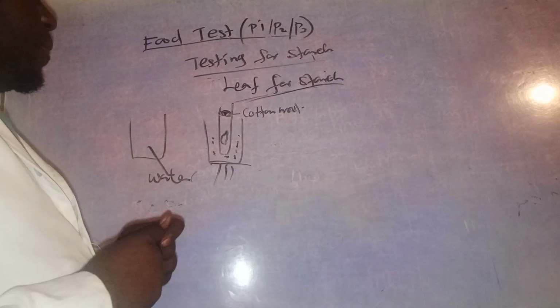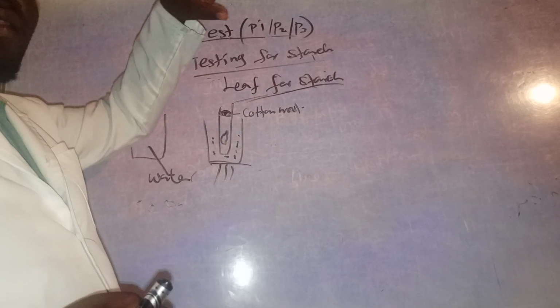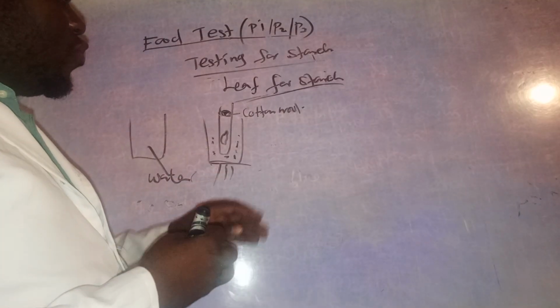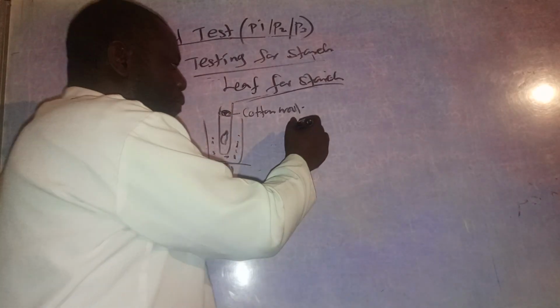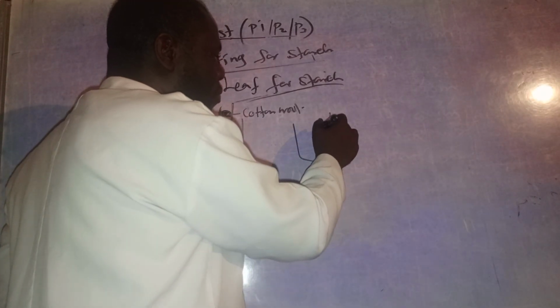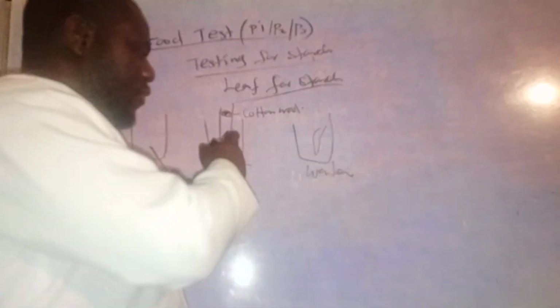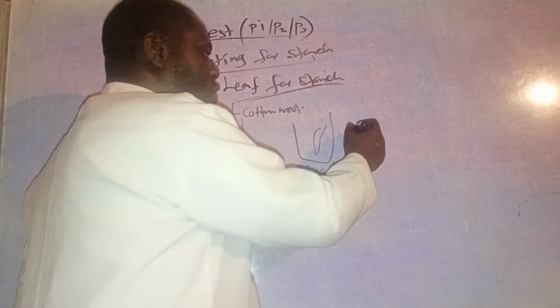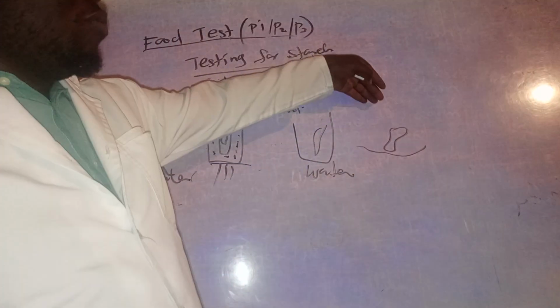Okay. Immediately after removing the leaf from the alcohol, the leaf becomes brittle. Brittle means the leaf will be hard and impermeable to iodine solution. So the best way after removing the leaf from alcohol is to dip it in warm water in order to soften it. Then you get the leaf, place it on the white towel, and add 2 drops of iodine solution.